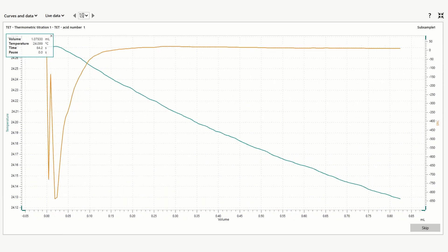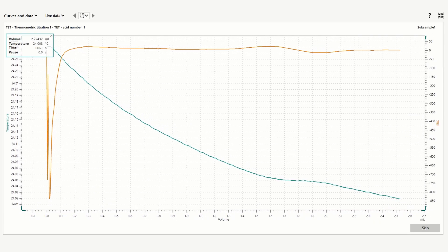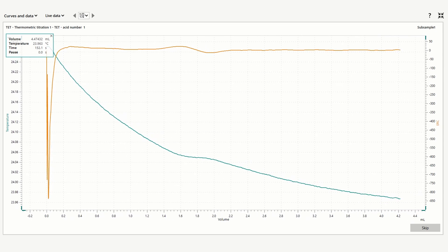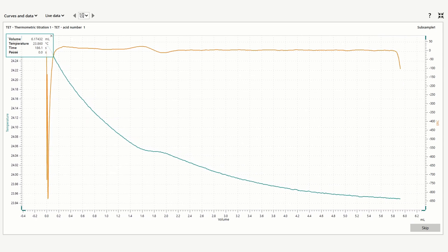One advantage of thermometric titration is the speed. Results are typically given much faster compared to potentiometric titration.